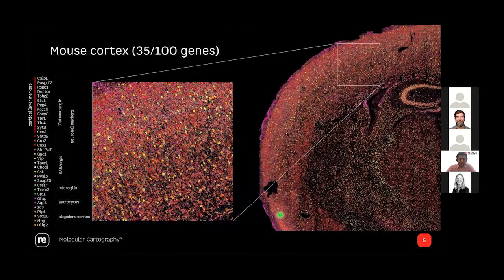Now we are going to look at different cell types. As you know, brain is a very complex tissue, and really fascinating to study, whether it is in development or health or disease. And what happens in health and disease is change in different cell types, right? And brain has different cell types, neurons, astrocytes, and as Omar was nicely pointing out, different subtypes of astrocytes and so on. I'm not going into the subtype specific story in this presentation, but what I would like to show you are different glutamatergic neurons here, which are presented in red, GABAergic neurons, microglia, which are green, astrocytes, which are magenta, interspersed here in the tissue, and oligodendrocytes.